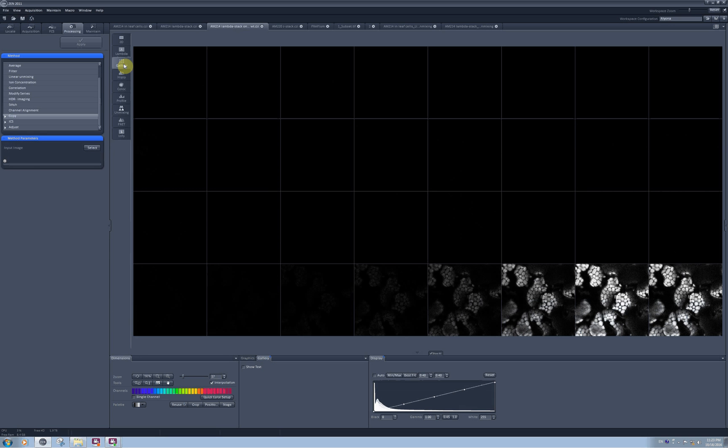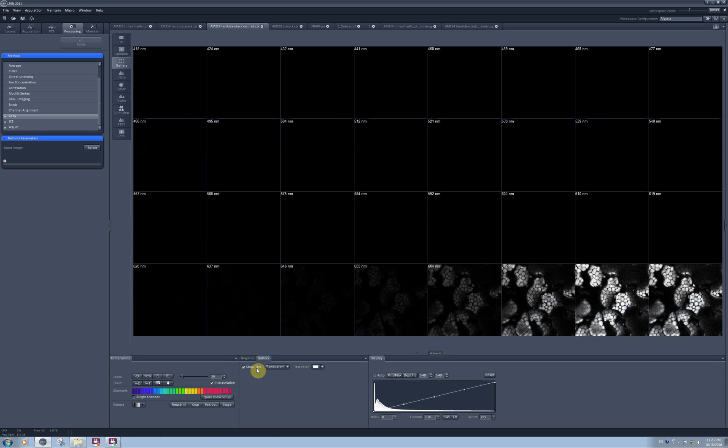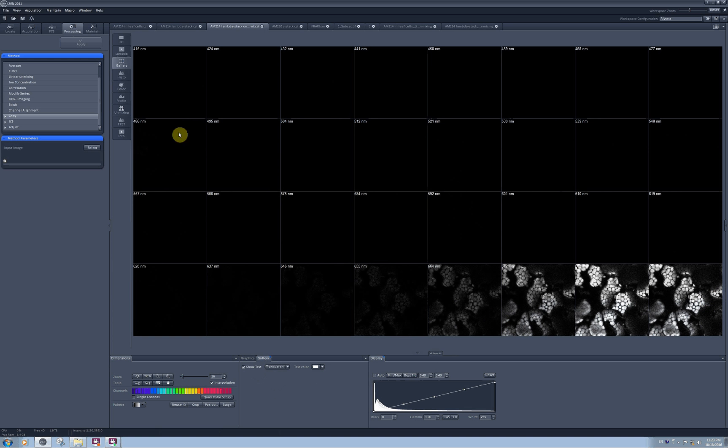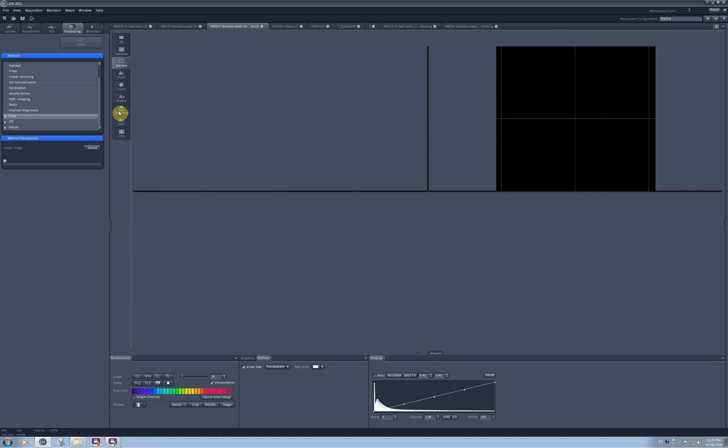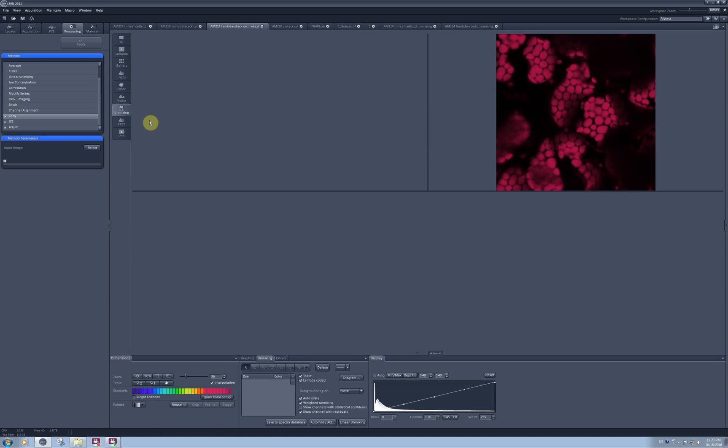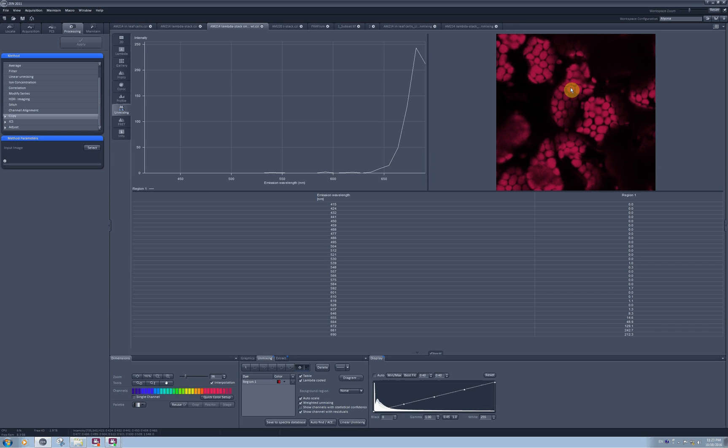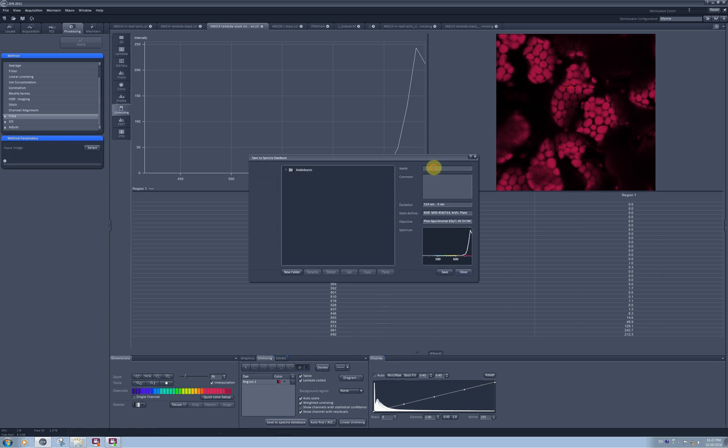If I go to gallery, I can see that I have only one component here present now and it's chlorophyll. And when I proceed to the unmixing tab, I can very easily select any pixel I want to create the spectra, and I can save this spectra into the database by clicking here. I can name it, for example, chlorophyll and save it.